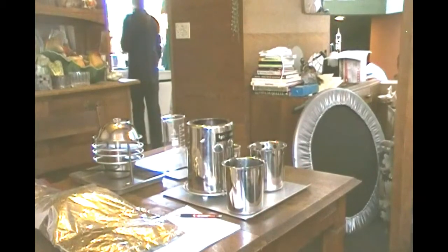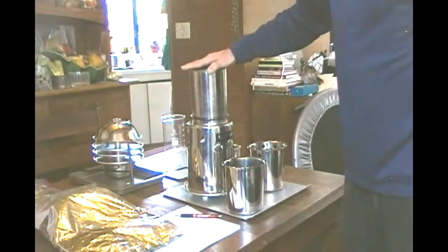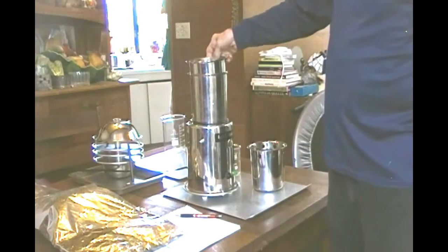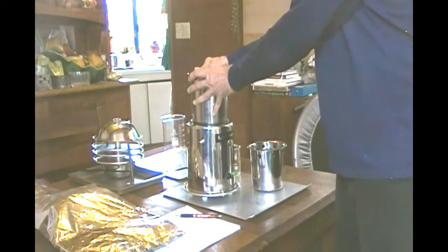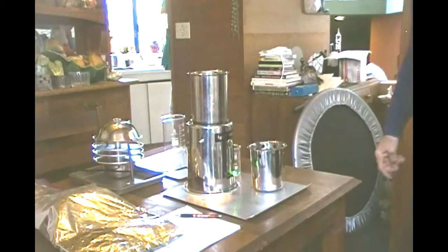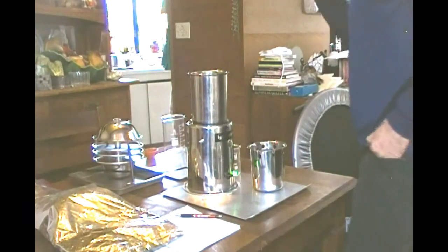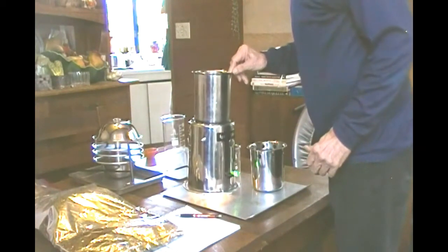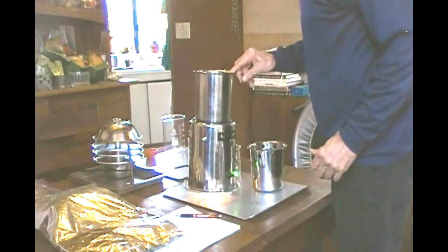Hot tap water. Put the processing vessel back in the unit. Put the water bath part in. We're leaving the top off. And we turn it on. Okay, so this has run for a few hours. We look right in the top. It seems like almost all the alcohol's gone.